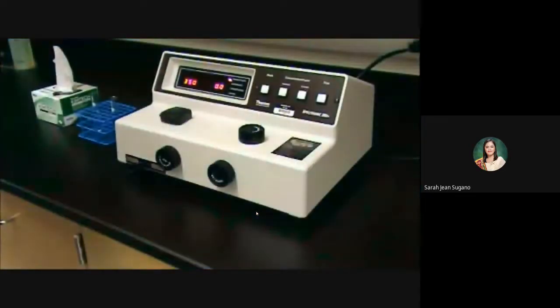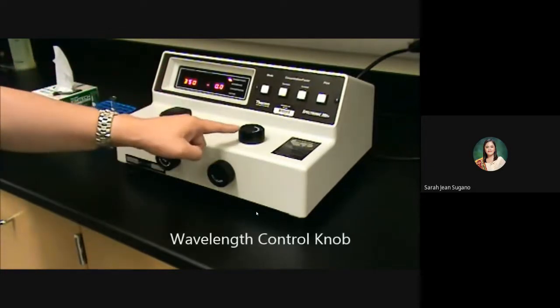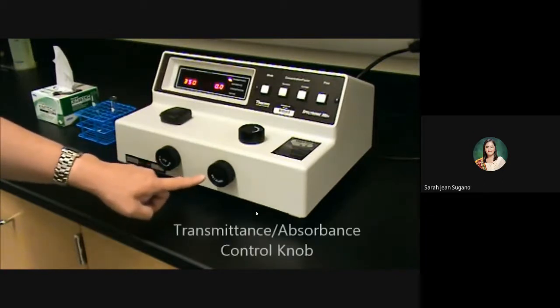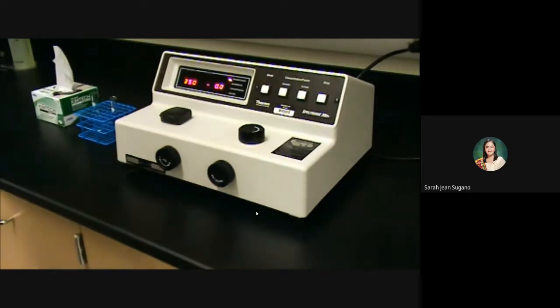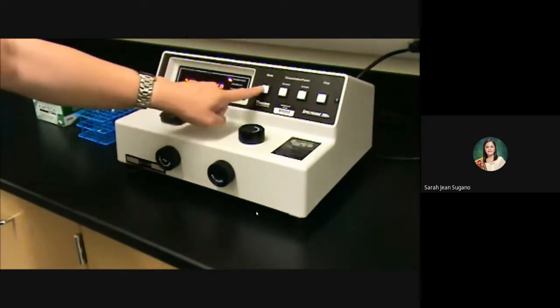First, let's go over the parts of the spectrophotometer. First, you have the sample compartment. The lid opens and closes to put your sample inside. You have the wavelength control knob to change the wavelength. This is called the zero control on the left-hand side. And this is the transmittance absorbance control on the right-hand side. Right on top is the mode select button. And when you push the mode select button, you'll notice that the LED will change positions, and so will the readout.